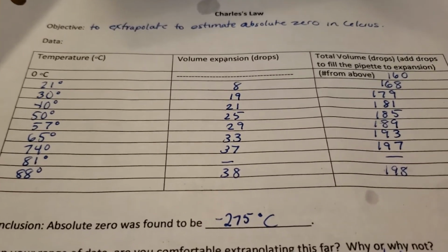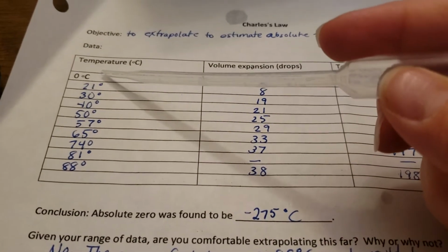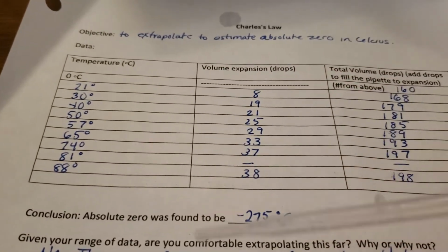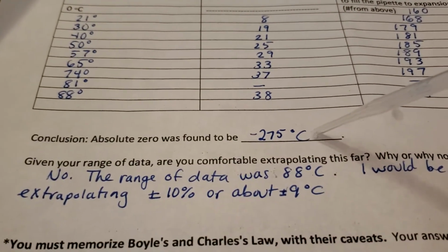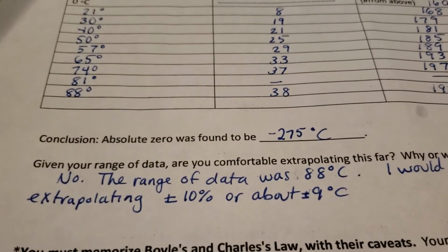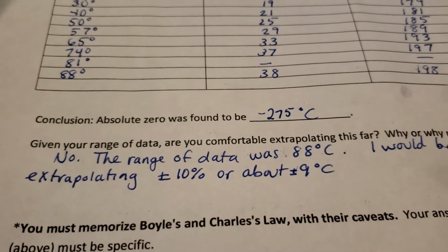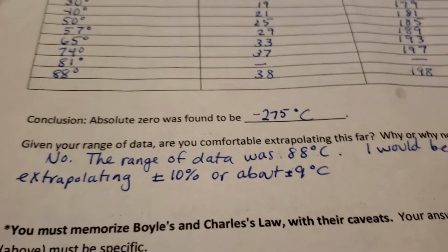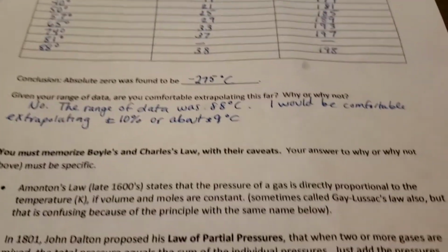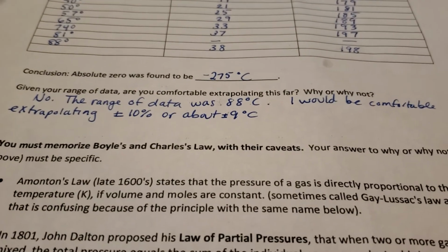But anyway, I extrapolated my data. You can see the range of data that I collected was from 0 Celsius to 88 Celsius. I extrapolated all the way down to see where it would cross the x-axis, and it crossed for me at about negative 275 Celsius. Now that's great because we know absolute zero is negative 273.15 Celsius, so we got extremely close. And I'll attach my graph with my best fit line drawn on. The best fit line was pretty faint on my phone, but hopefully you can see it.